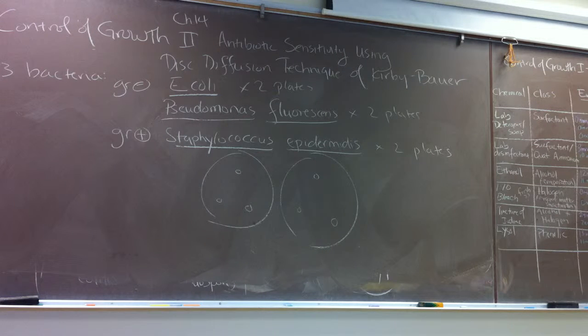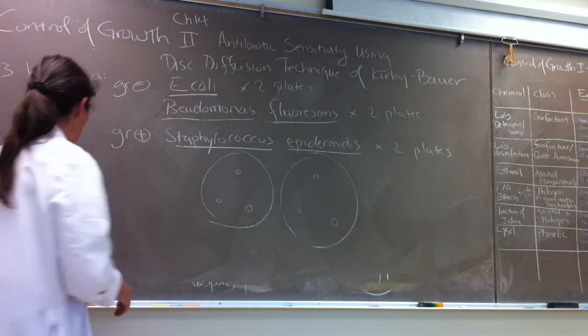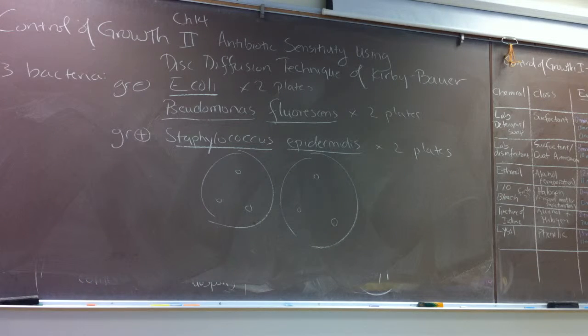Okay, and we are going to have you incubate them inverted. So that's why we need to put a little bit of pressure on the disc so they don't fall off. Okay, so the antibiotics that we have are beta-lactams. We have penicillin and ampicillin.